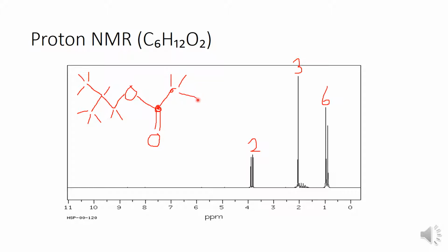Well, we have 1 peak right here. So this was our CH3 functional group, and it has an integration number of 3, as we discussed earlier, which are counting for each of these 3 hydrogens that are in the environment. 1, 2, 3. So this goes with this peak. We will draw that arrow in there real quick.